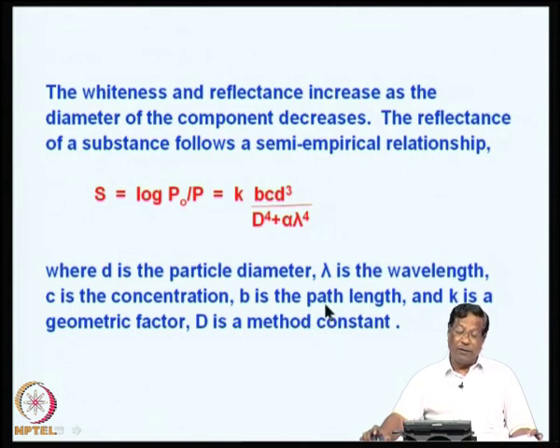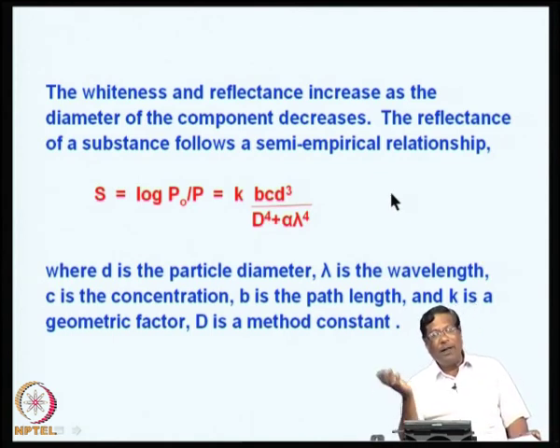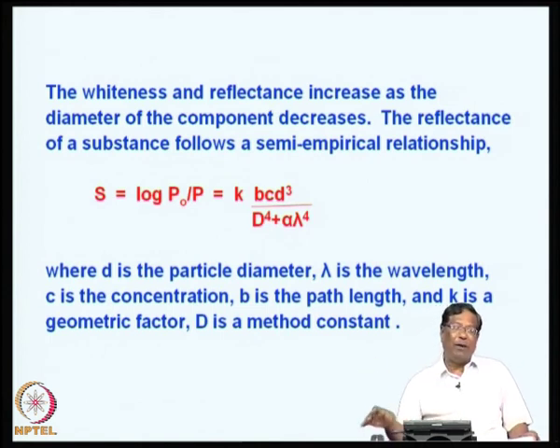The manufacturers of standard white reflecting material will give you the value of D. Now, if you use this value, you can standardize your substance like paper etc., into a particular standard value. Then using the reflectance in the spectrophotometry, it is possible for us to obtain that value, keep on controlling the process parameters until you get the correct reflectance, then the batch can go for production.